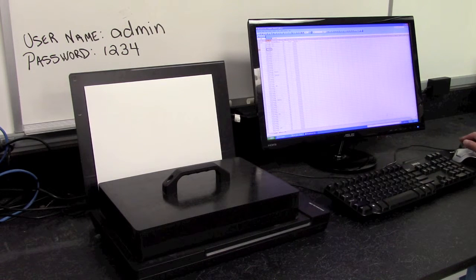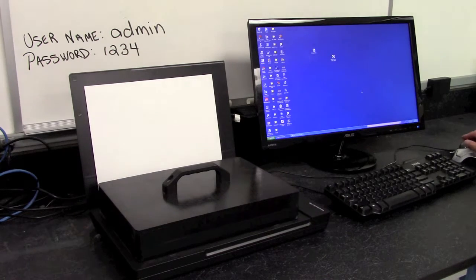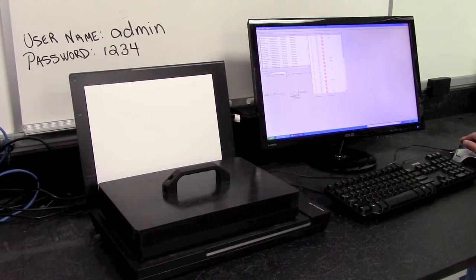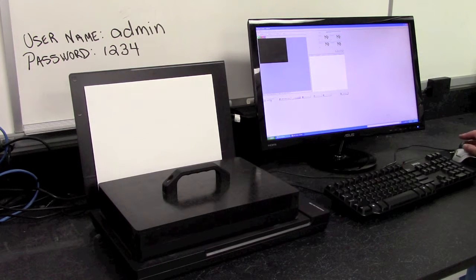And when you go back to your desktop or wherever the file was saved, you can now open those results in an Excel file. And at this point, you can further manipulate results by entering in further sample information. You can save this data, print it, whatever you want to do at this point.